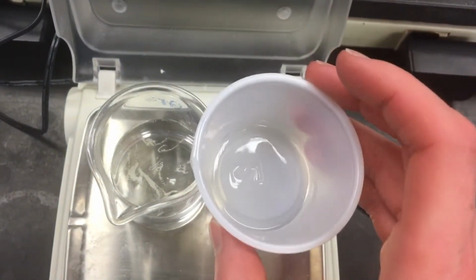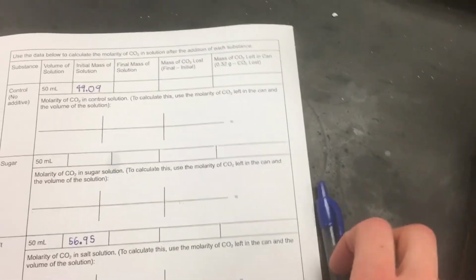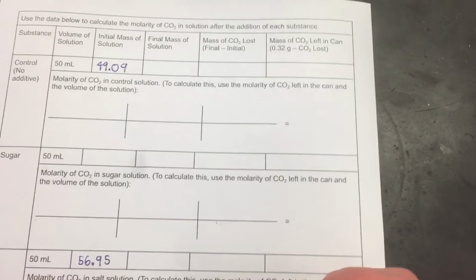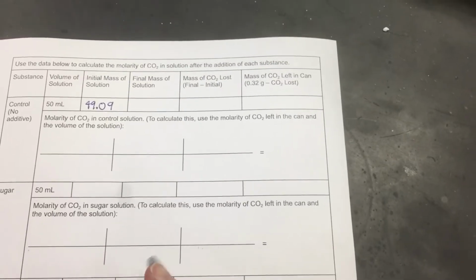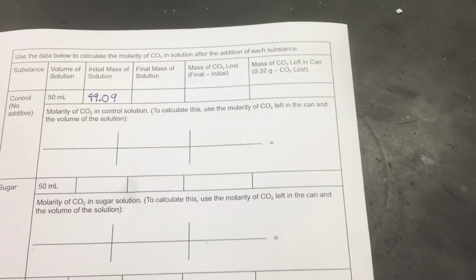Okay, we're going to let these sit for a minute, and hopefully you can kind of guess what's going to happen. As we let these sit, we're going to see that carbon dioxide is going to leave, or at least in some of them, carbon dioxide is going to leave, and you're going to see that the mass has gone down. So I'm going to show you the final mass of each solution, and you can go ahead and write that down in the final mass box.